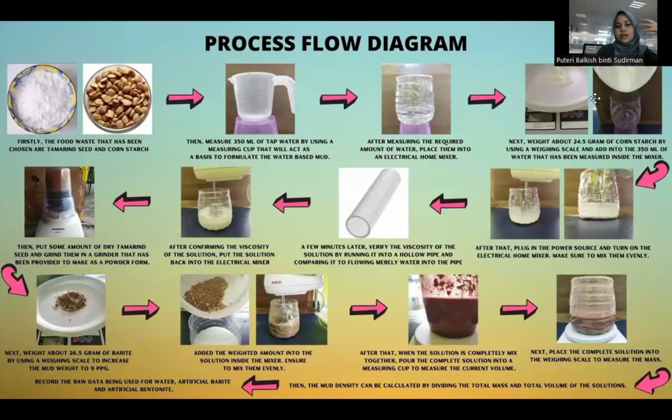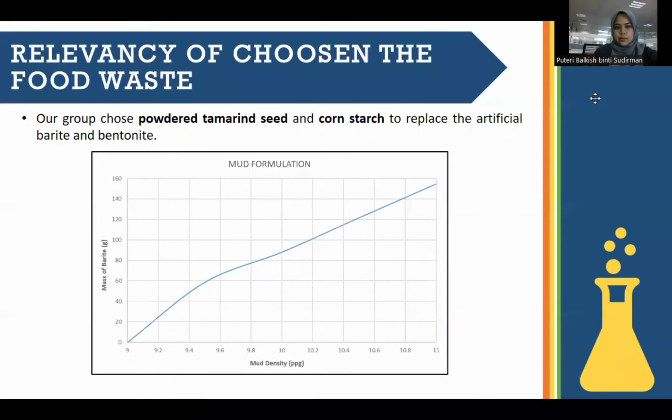Lastly, record the raw data being used for the water, artificial barite, and artificial bentonite. Next, we pass to the next presenter.